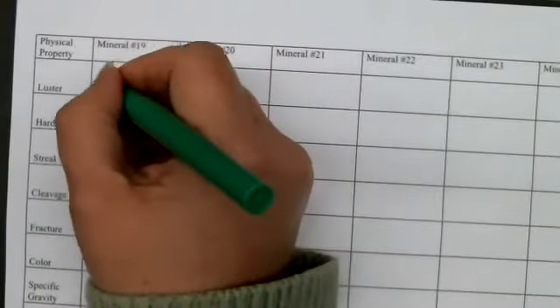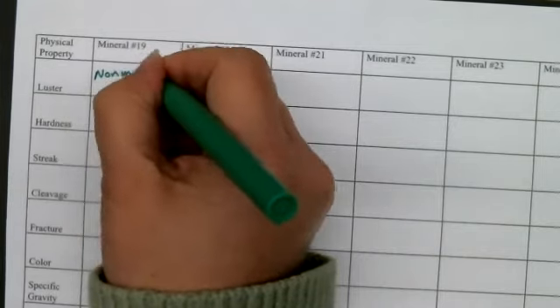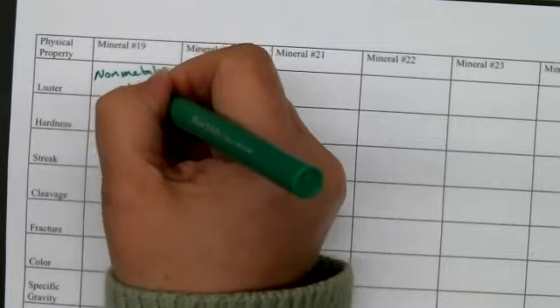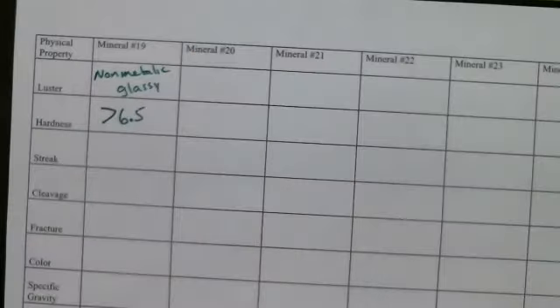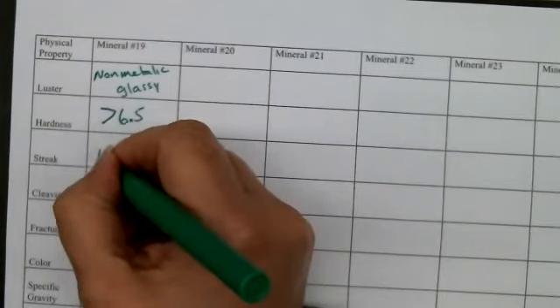So what we've got is greater than 6.5, because that's what the streak plate is. Its luster is non-metallic and glassy. All right, it did not leave a streak, none.